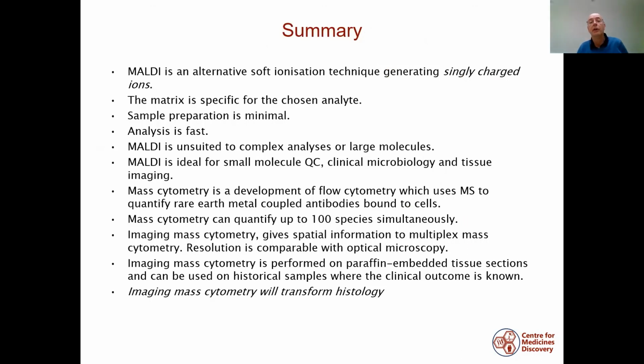So that's really all I want to say about MALDI. Just to summarize, think of MALDI as an alternative soft ionization technique to electrospray, and it's different in that it generates singly charged ions. The matrix needs to be specific for whatever it is you're analyzing. So it's not a generic technique. You need to choose the right matrix. There isn't very much sample preparation necessary. The analysis is extremely fast.